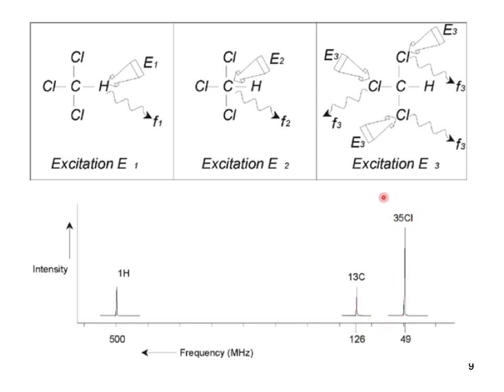For example, chlorine has a different peak, different resonance, different frequency. Carbon has a different frequency. Hydrogen has a different frequency. So a different frequency is required in order to get information about the different nuclei.